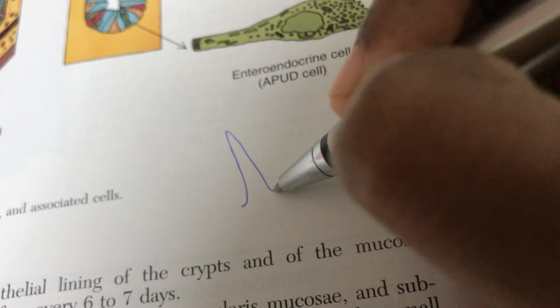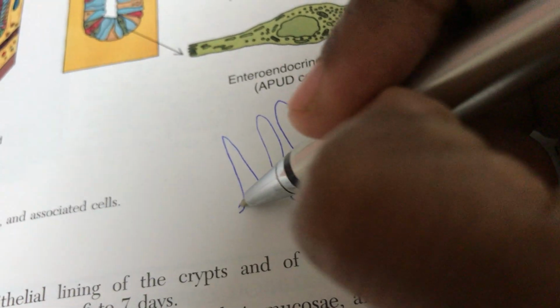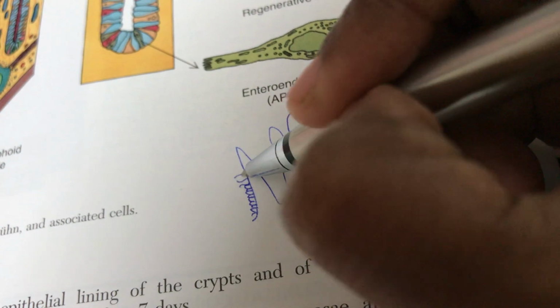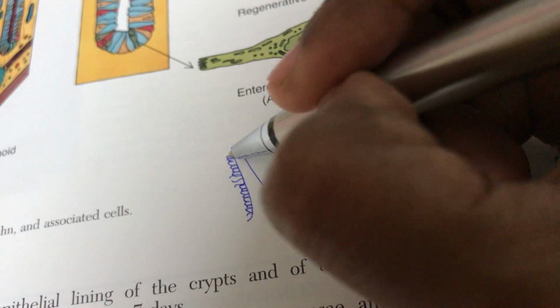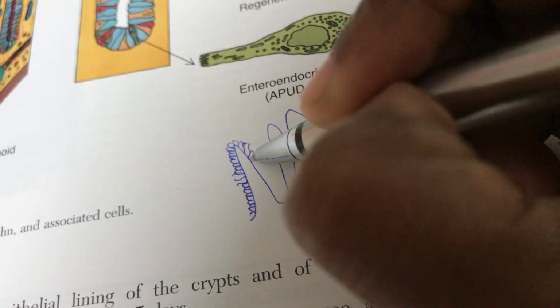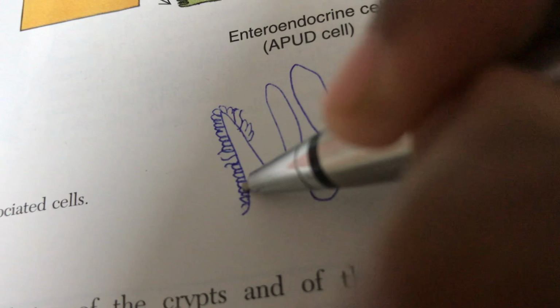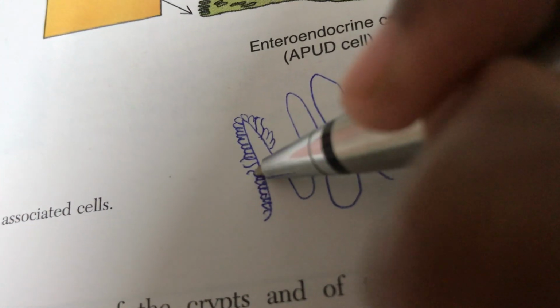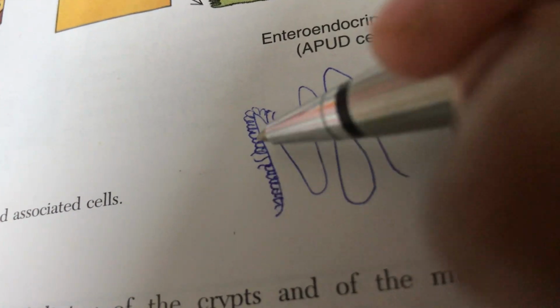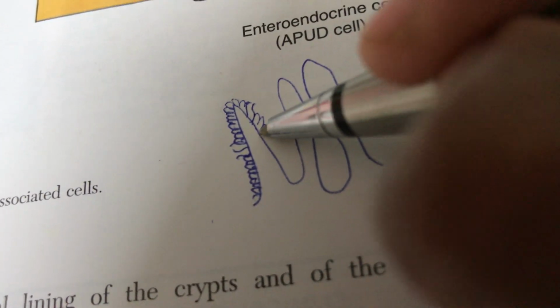So when you draw the ileum, you have to draw the villi, and this is the villi. Here we will be drawing the simple columnar epithelium with the goblet cell in between. So you have to draw the epithelium up and then the goblet cell again. Goblet cell doesn't have the nucleus, so while drawing the nucleus you have to put 1, 2, 3 columnar. So you have to put them longitudinally like this. The nucleus should be like this. Don't draw a flat nucleus.